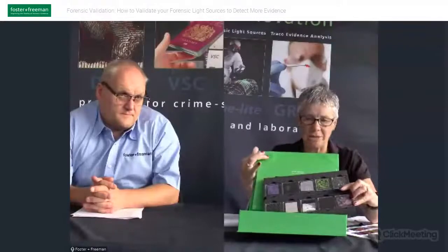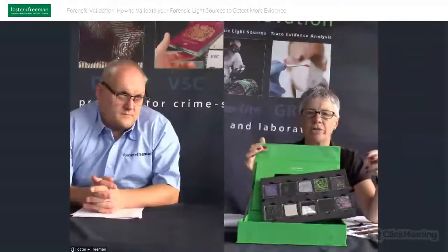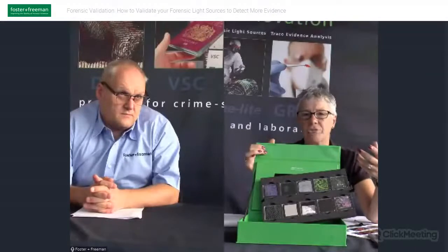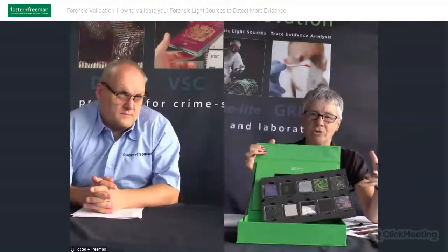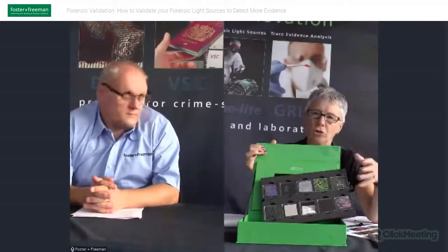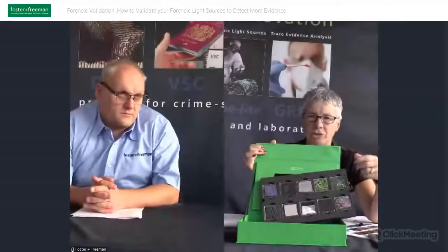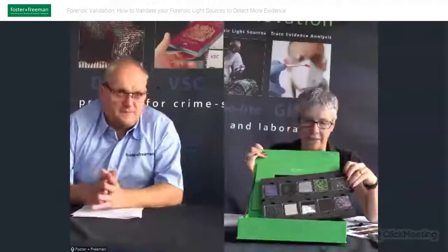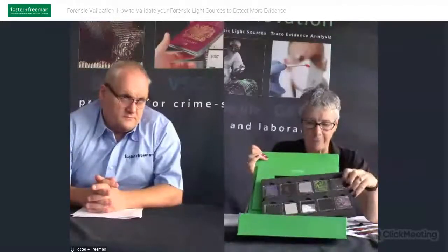And the samples are chosen so that they do look the same as the real deal, so the real body fluid, the blood would look the same under the Crime-lite. They react the same, don't they? Yes, exactly. And so they've been very carefully selected, but there are real samples in here too.